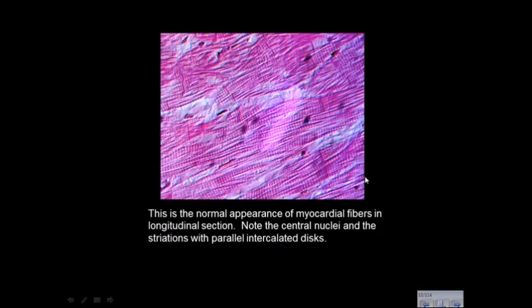Okay. Here is a histological representation of the heart. And after we do a dissection tomorrow, we're going to look at these. Or we can even do it today. Probably, let's do it today. This way all we have to worry about is dissecting. Okay. We'll do blood typing and pull out some stuff.